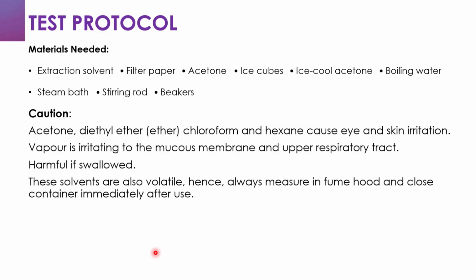One caution that we have to take note of when performing this experiment is that the acetone, diethyl ether, chloroform, and hexane cause eye and skin irritation, and their vapor is irritating to the mucous membrane and upper respiratory tract, and they are also harmful if swallowed. Hence, these solvents must always be handled in the fume hood and the containers closed immediately after use.